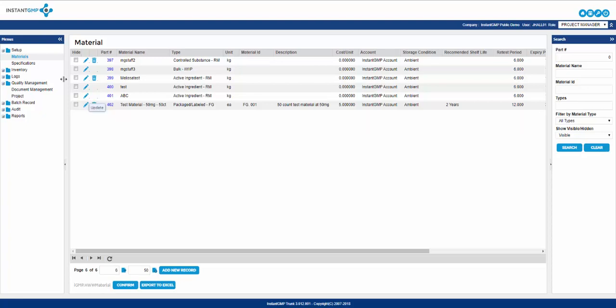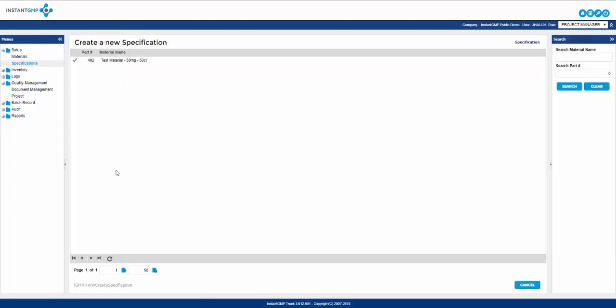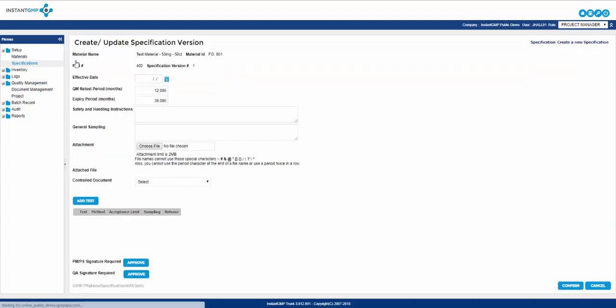From here you can move on to specifications. There are two ways to add specifications. You can choose add new record which will pull up a list of all materials without a specification which you can click on the green arrow or you can scroll through the visible list and click the pencil to update the specification. Once inside the specification you are presented with a new entry screen. Some information is auto-filled such as the material name, part number, and specification version.